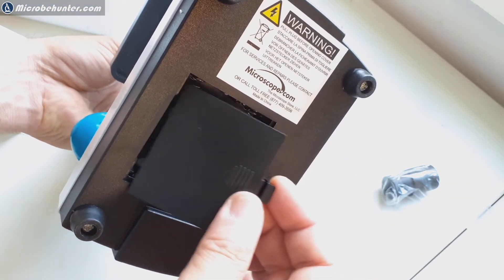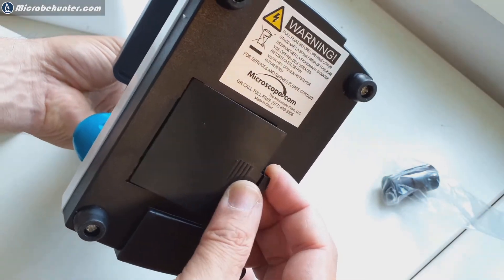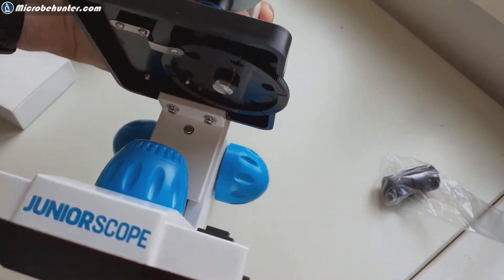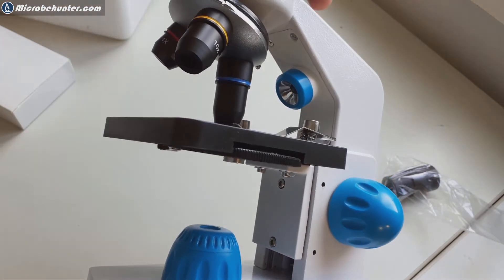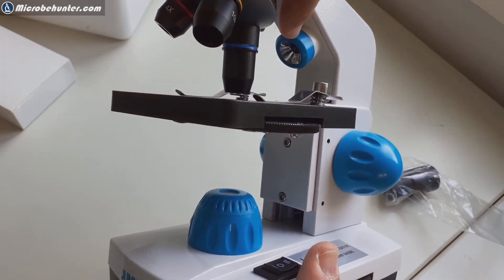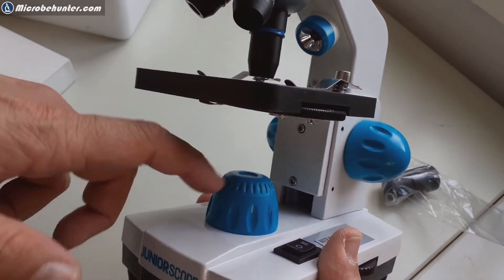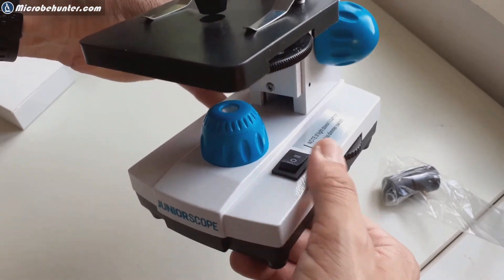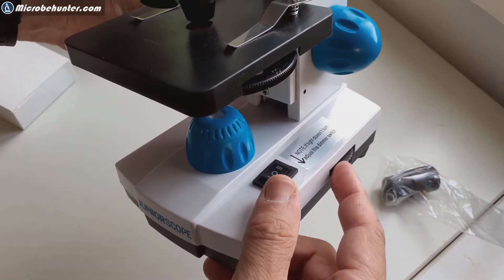Three batteries go in there so it's four point five volts and yes it has three objectives 4x, 10x and 40x and there is also lamp from the top and also from the bottom and the main switch is able to switch it off and top light or bottom light and there is also a dial on the side and with that you can regulate the light intensity.